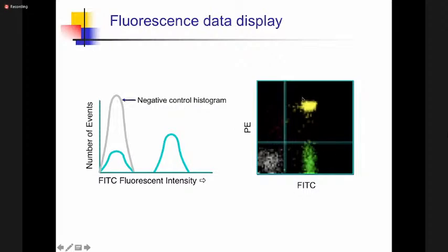If you divide these quadrants, you do not have to divide them proportionately, because the population of these cells will be scattered differently. I mentioned the bottom left: here are those cells which may be less granular or have less of the marker you are targeting. Those which have more of the marker you are targeting could be scattered either in this larger quadrant or the far right, this green quadrant.